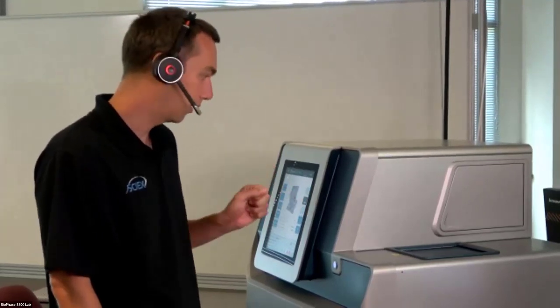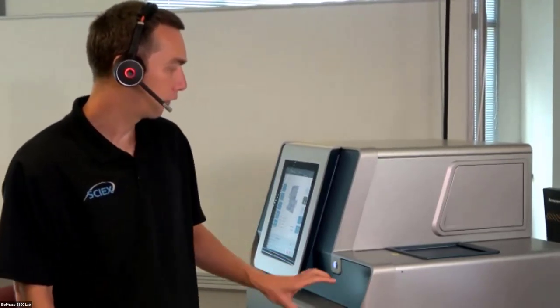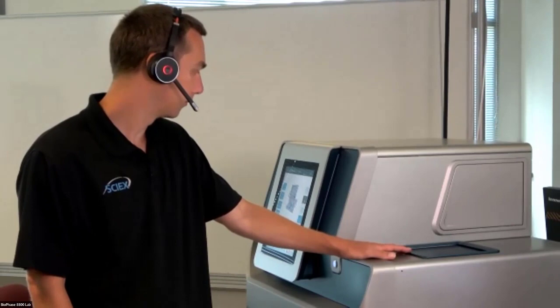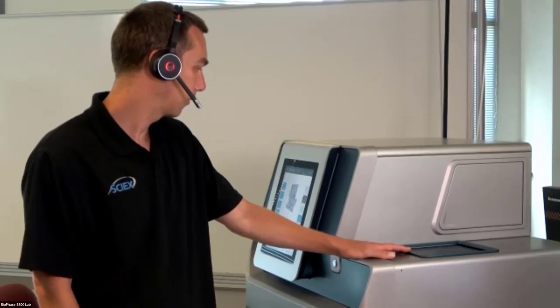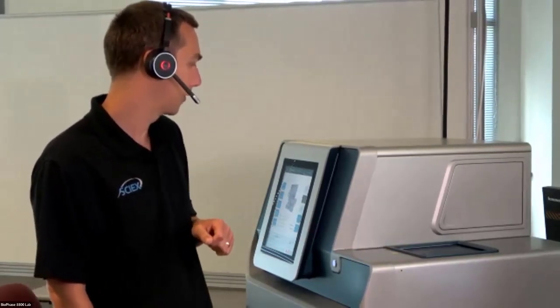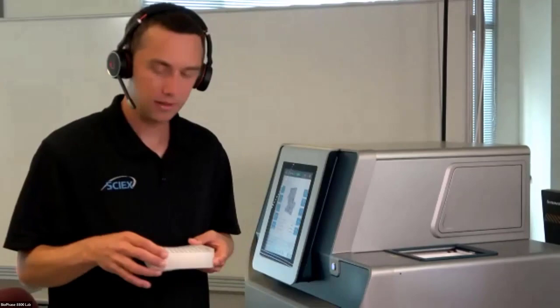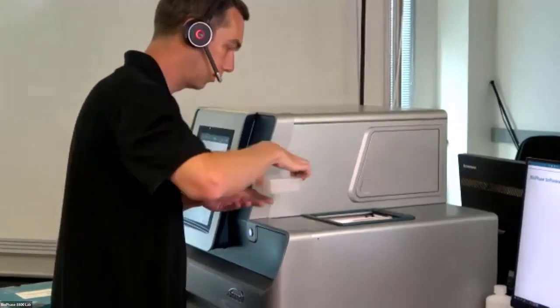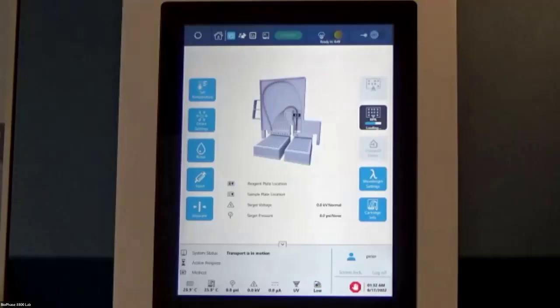Now we can eject our reagent plate. Now the reagent plate is stored in a different part underneath the system, so it's just going to move that over to our little partition here, our little garage. It takes about 10-15 seconds here. It's almost done. We can actually see the percentages of how close it is. Now it's opening that up. So now we can take the reagent and outlet plate that we have here, load that in. So we do that, we load our reagent plate, click that button, it closes up, and that's ready to go.